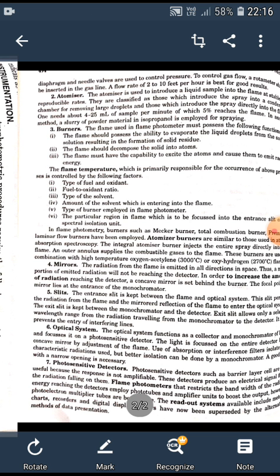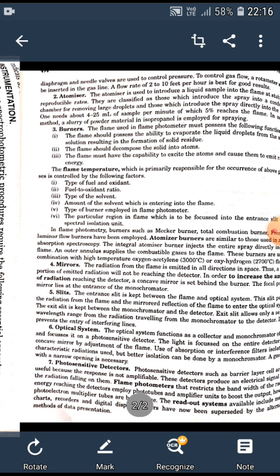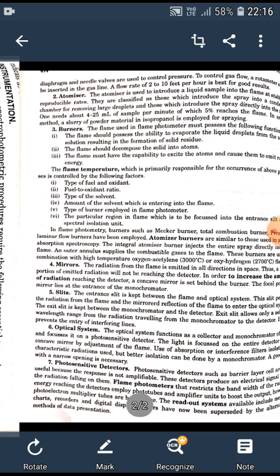The light of the selected wavelength strikes a photodetector and the magnitude of the electrical signal developed is read on a meter. The flow rates and the ratio of fuel to oxidant are adjusted by introducing pressure regulators and flow meters in the gas line. The spectral lines corresponding to low excitation energies are produced. The flame spectrum so formed is very simple.